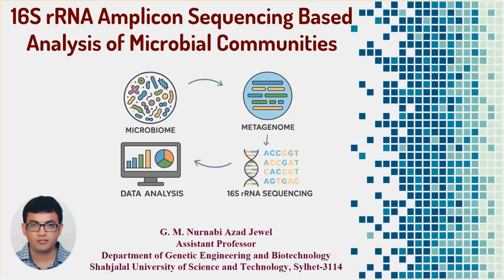Hello and welcome. Now we are going to talk about one of the most important file formats in sequencing data analysis, the FASTQ file. If you work with next generation sequencing, or NGS, this is the very first file you will encounter. So understanding FASTQ is absolutely essential.